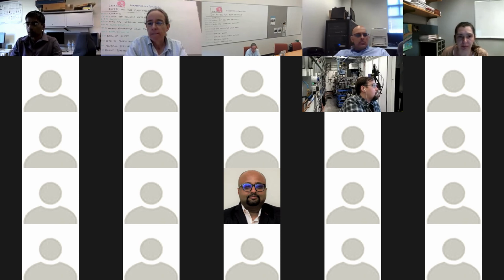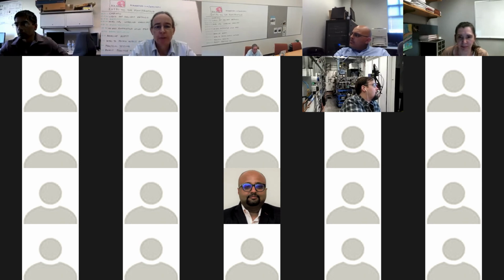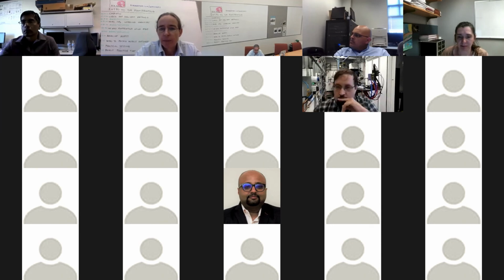Of course, we should also say at the same time that we're aware that almost every single data set is different. So don't feel shy about asking us. We do that all the time, help people with data sets. All right, I just put that website up in the chat window. So my hope is that over time, we're going to post more and more instructional videos up there to help people out with the footprinting method.